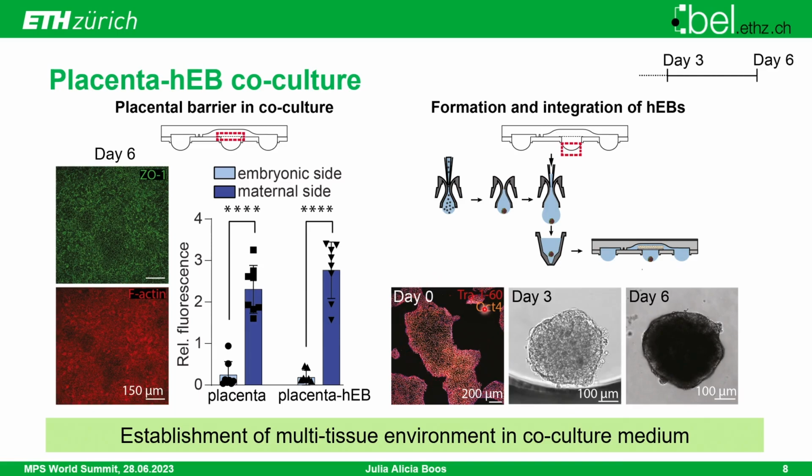First, we always confirmed the pluripotent nature of the iPS cells, to really know that we can differentiate them into all the 3 germ layers, by staining for 2 pluripotency markers, TRA-1-60 and OCT4, before the formation of the EBs. And also when we looked at the morphology of the EBs under co-culture conditions, they showed a healthy and compact morphology. However, here we wanted to go a little bit more into detail to really assess the potential of the EBs to differentiate into the 3 germ layers, to get a bit more insight into the embryotoxicity effects of drugs or other molecules that you want to test.